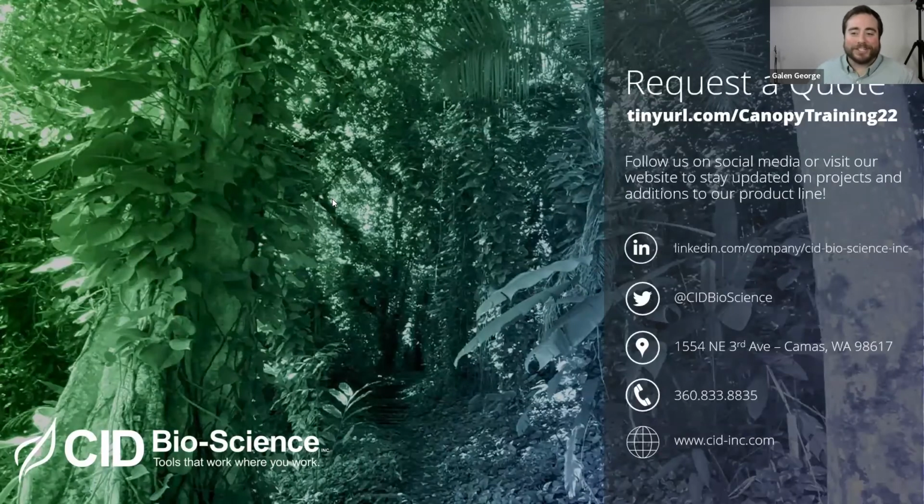That's a great question, Derek, because that is a little bit of a bummer if you forget to save the default and then you need to go back and you've got a whole bunch of images you have to update. As far as I know, no, there's no way to do it all at once. You do have to go back and do each one individually. But I'll talk to our engineers and see if there is a workaround for that, so that you don't have to take the time if you forget to save those defaults. That's a pretty big punishment for forgetting to save the default. So yeah, thanks for asking that though.